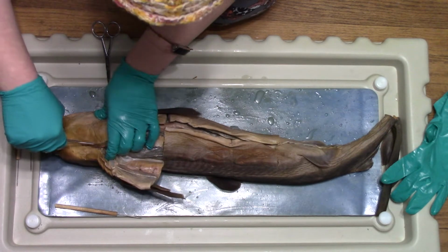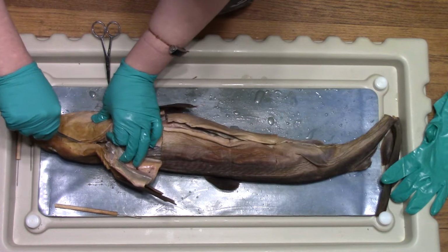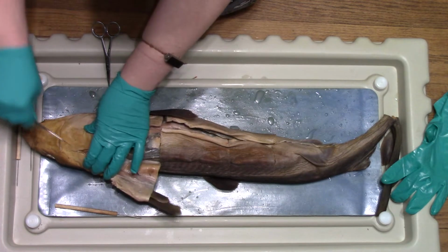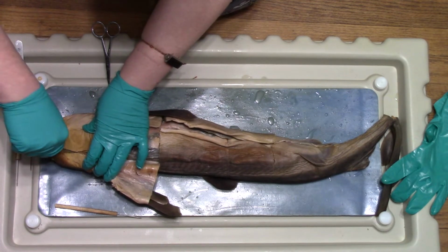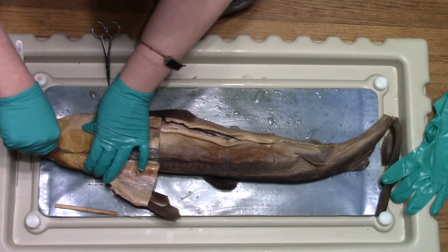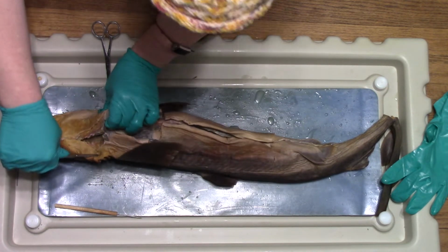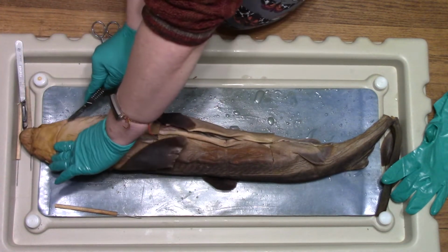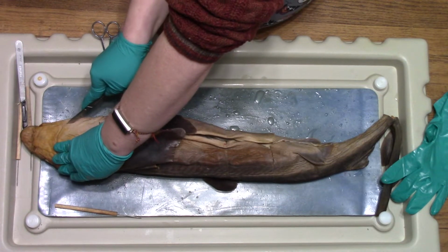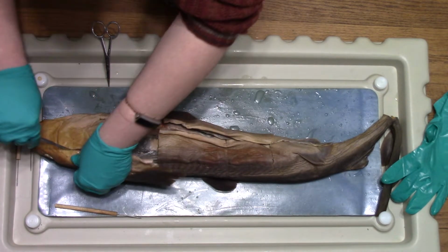I'm glad I got a nice new sharp scalpel though. You might recall my last video of the lamprey, I did not put a new scalpel blade on my scalpel and I regretted it. It's always nice to do these dissections with a nice sharp scalpel. It's a safer project. I think I'm going to have to do both sides. I don't think this is going to come out.